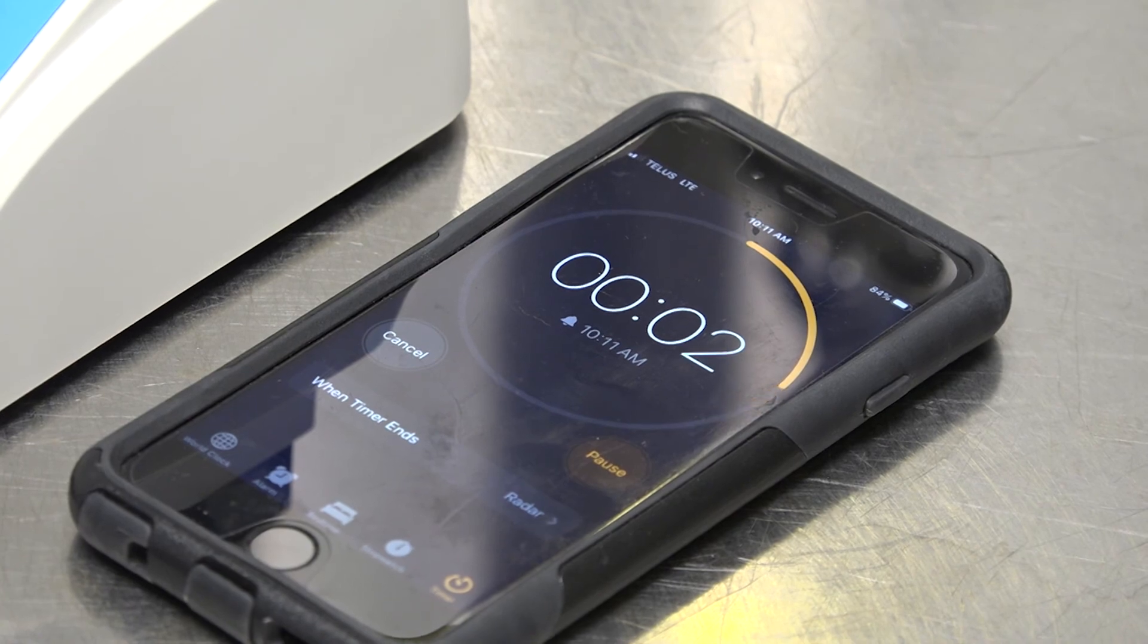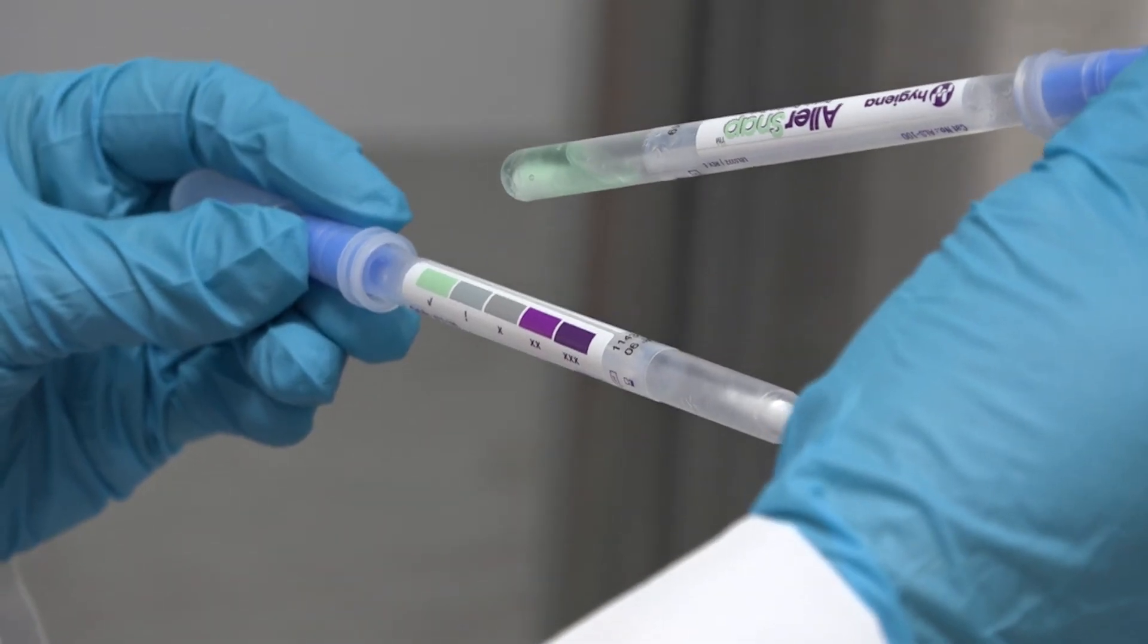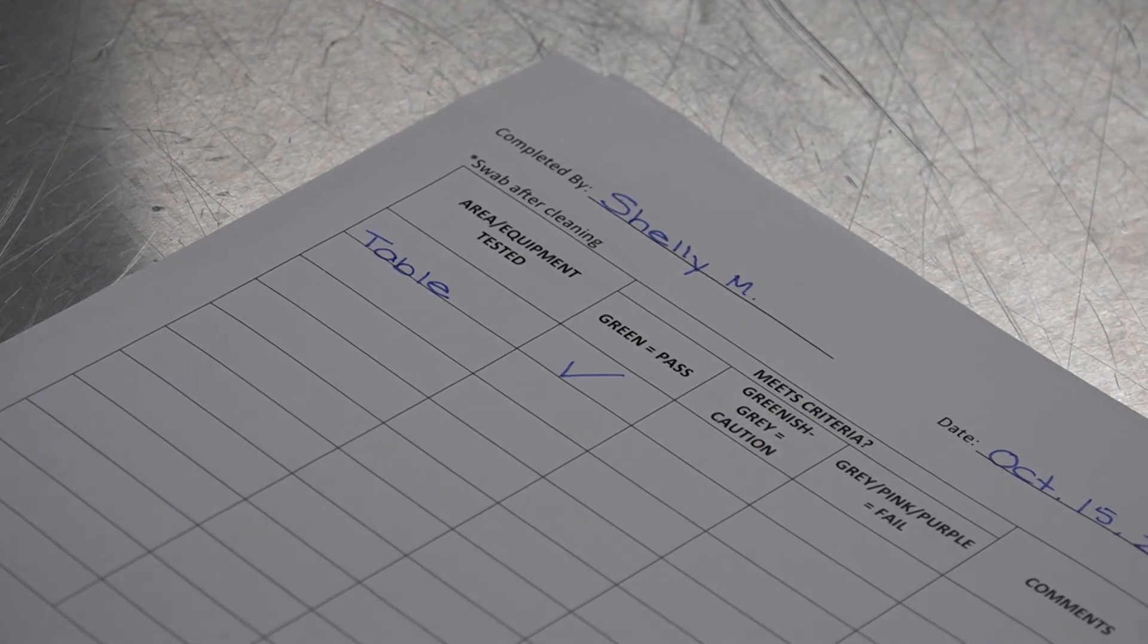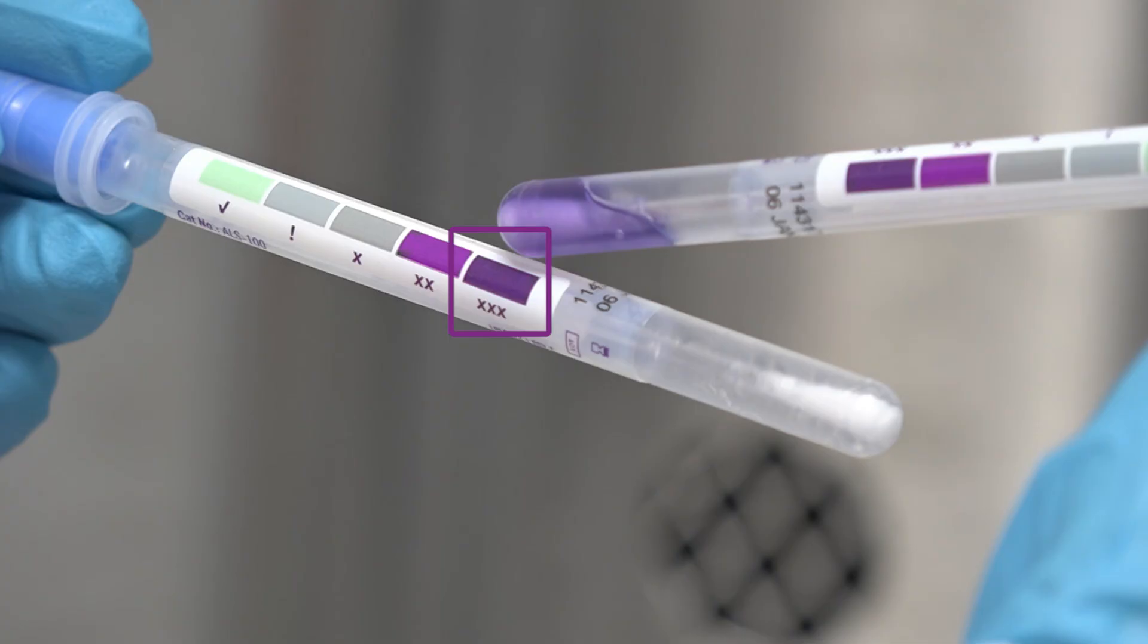Step number ten, when the time is up, compare the color of the liquid to the color chart label on the side of the swab. Record results on the monitoring record. Green means the surface is clean and purple means there is protein remaining on the surface.